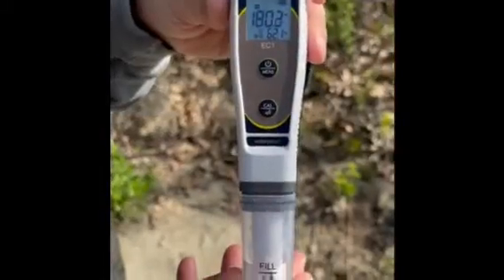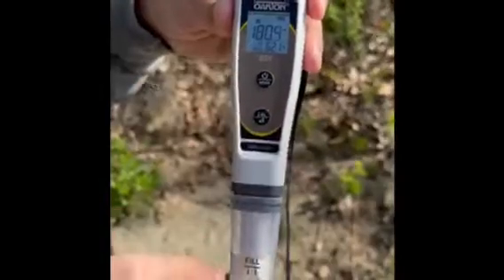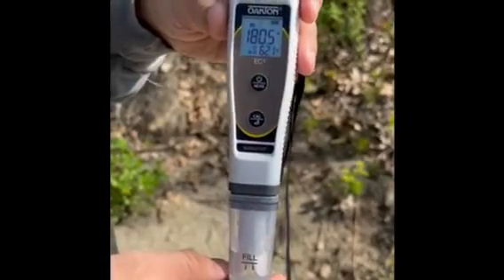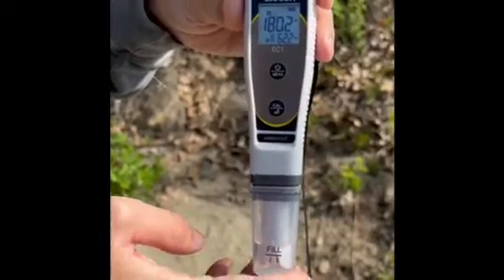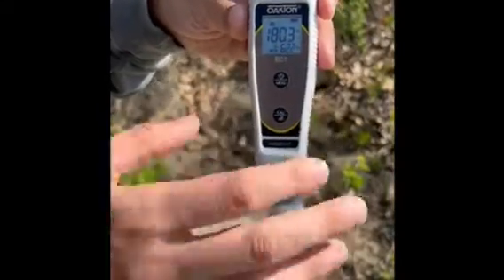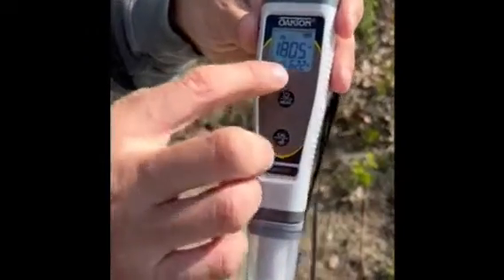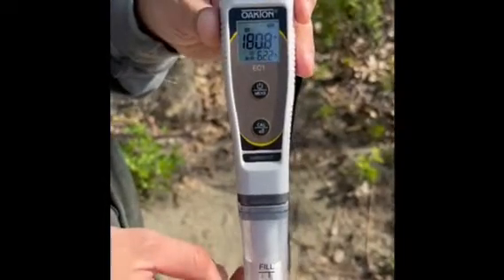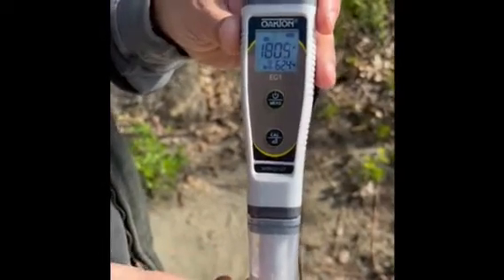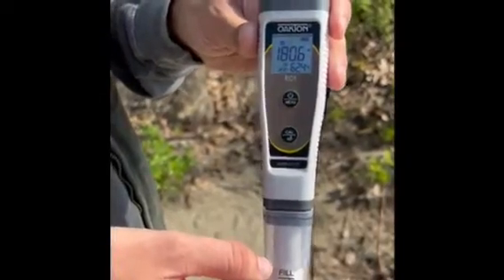It's been about two minutes that this pen has sat here, and you can see the conductivity rating is 180. It's been jumping around a little bit but it's about stabilized, fluctuating between 180.2 and 180.6. So we'll take this reading. You'll also see on the bottom there's the temperature reading at 62.2. On our data sheets we now have temperature as a data field you can report, so please make sure to write down the temperature as well.